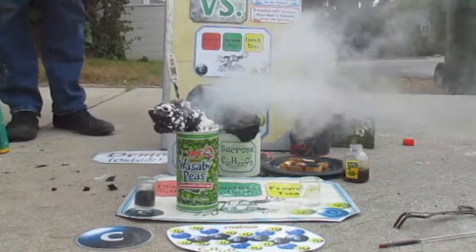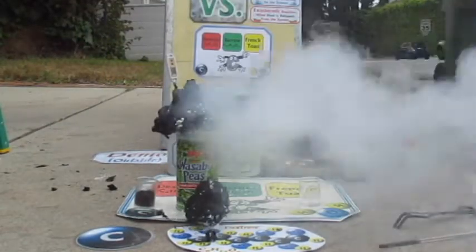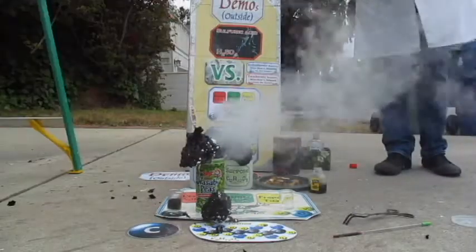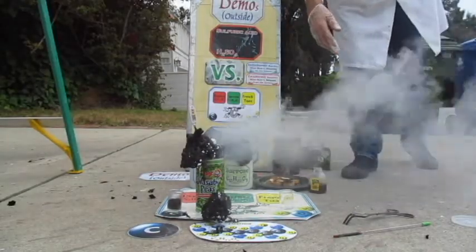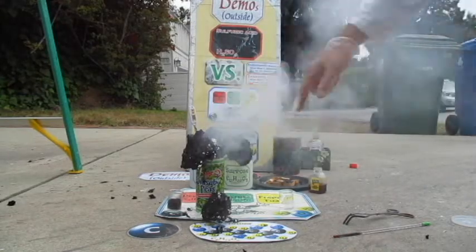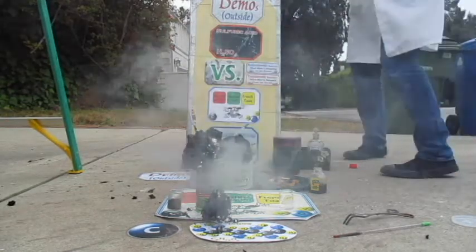That one happened really quickly, right? It started much faster, right? So the only reason to shift is if the fumes are heading straight toward you. Look at all that. Now this is actually mostly just water. This is the water that is leaving the carbohydrates, and there's the carbon. It's going wherever I go. It's aiming toward me, right?